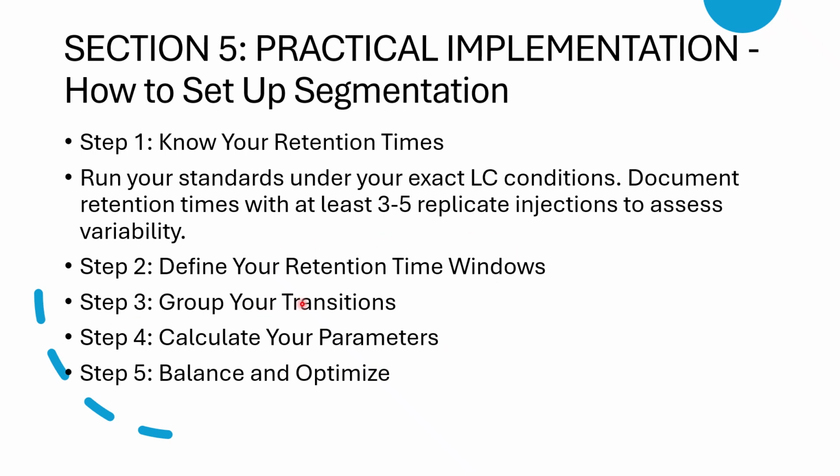Second step would be defining your retention time windows. Don't make your windows too tight. Instead of programming transitions throughout the entire LCMS method duration, monitoring is performed only within a time limited window around the expected retention time for defined compounds. I typically add plus minus 1 to 2 minutes to each compound's retention time to account for any RT drift over time, or any matrix effect, or column aging.